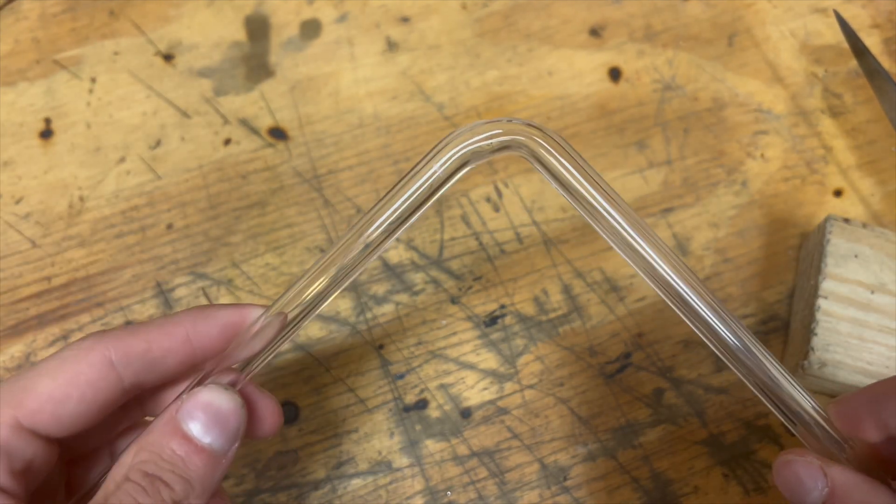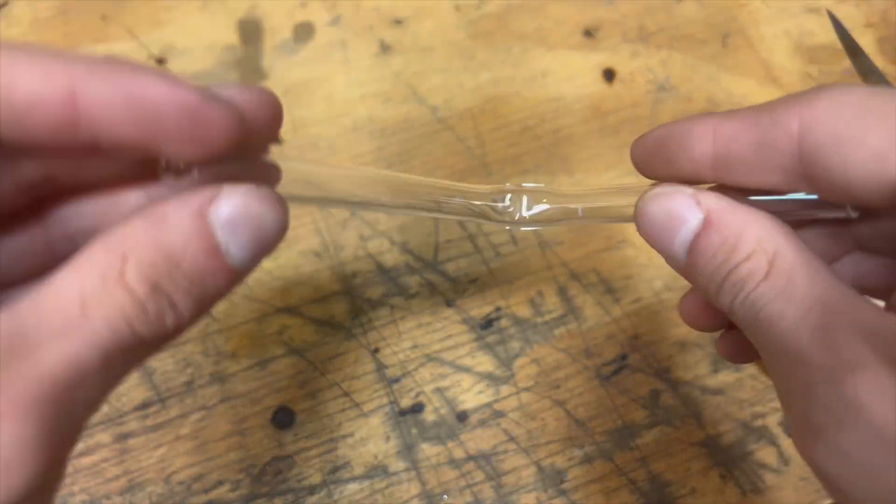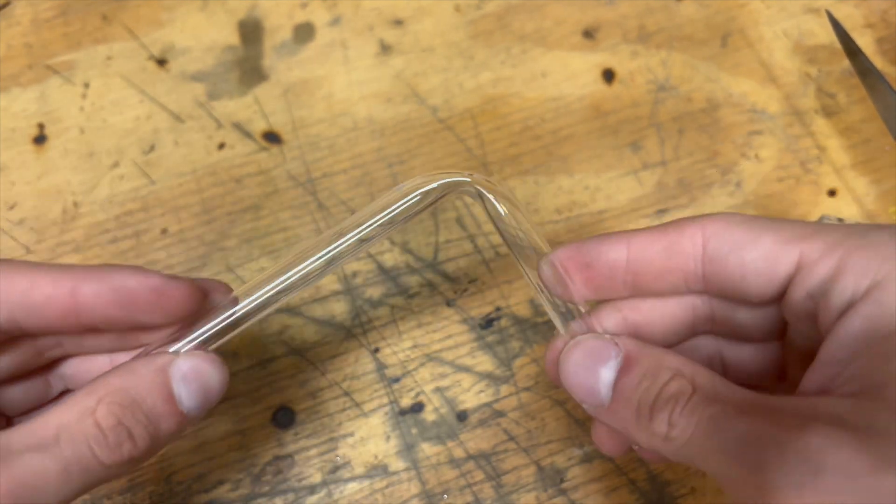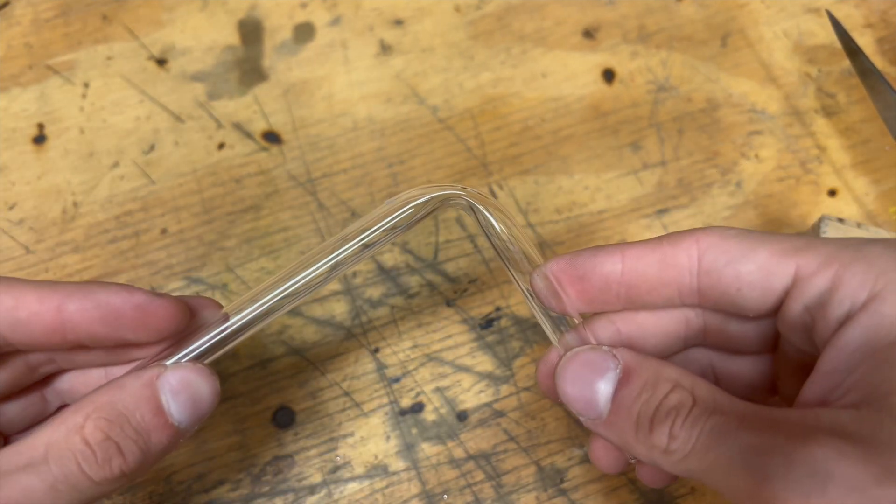But if you heat it too little, it'll just constrict the tubing and your outer diameter won't be the same as it is when it started. Your inner diameter will be all messed up, your wall thickness will be messed up, and it won't even look good.